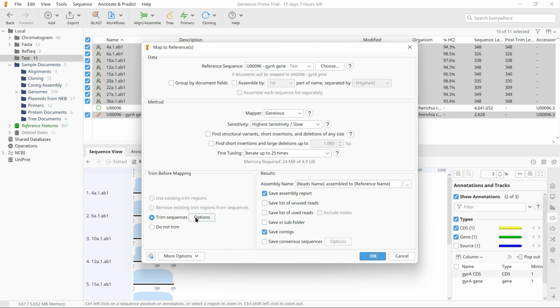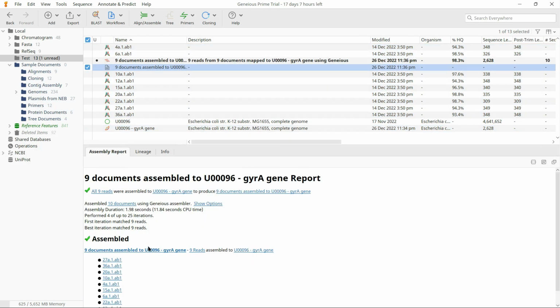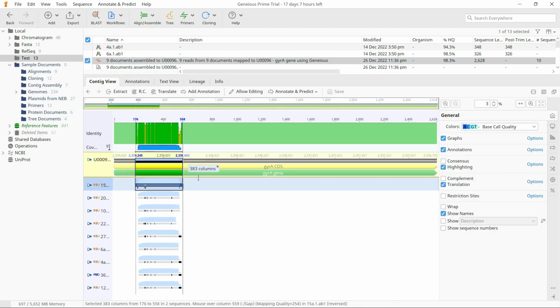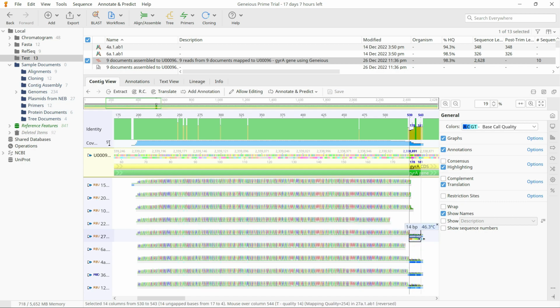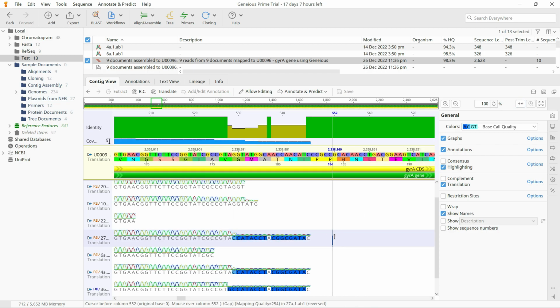For smaller sequences, it actually does not require as many iterations for confident alignment as it requires for sequences of varying lengths and sources. It takes a few seconds to create the alignment, and you can view the aligned position by clicking on the newly created alignment file. Select and zoom into the region of alignment for a closer inspection. The chromatogram view of these aligned sequences again shows the dark blue shading for low quality sequencing in this region. These bases created significantly smaller peaks and thus are not of very high quality output. It is wise to ignore these bases.